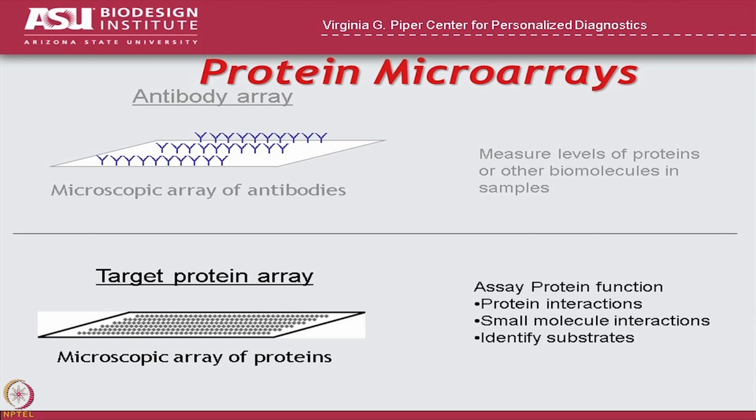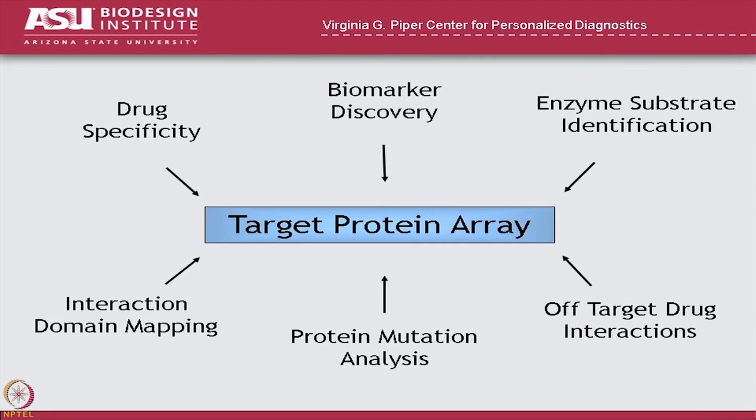So the idea on these slides is that you have a slide, and each of these different spots represents a different protein on the array. So there are lots of things that you can do with a target protein array. You can look at drug specificity. I'll show you an example of that later.